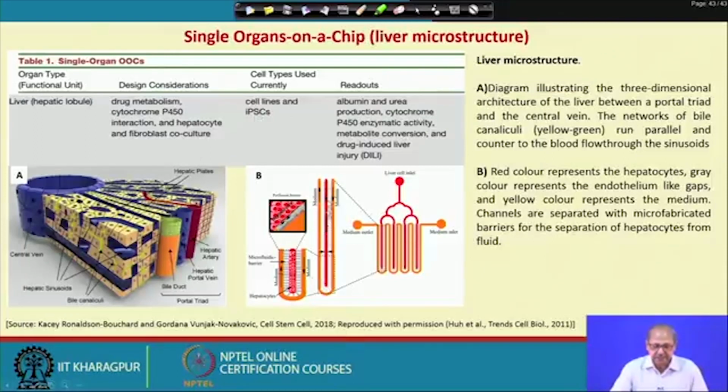So, here is the design of the microfluidic platform. This is the unit of the system, where liver cells are impregnated in high density in the middle layer, and outside there is a medium flow, and these are the microfluidic barriers which mimic the structure of your venous and arterial connection to the hepatocytes. The cell density here is near or almost equal to that in the in vivo system, with a medium inlet and medium outlet, and medium is perfused through where the hepatocytes are present in high density.